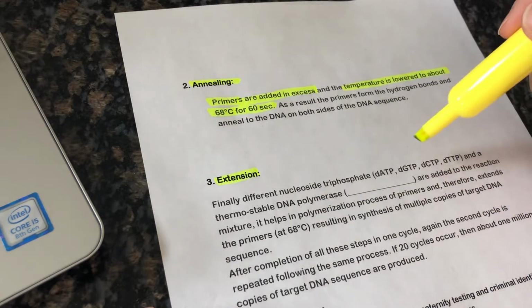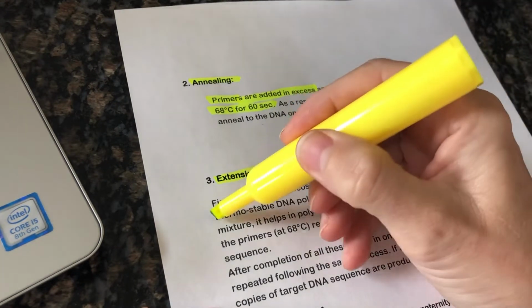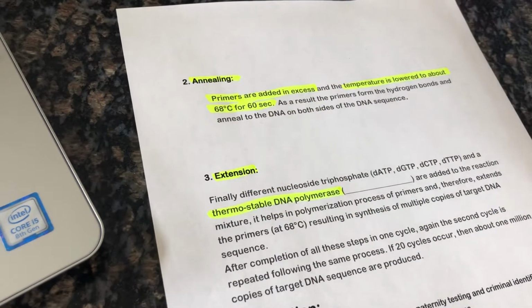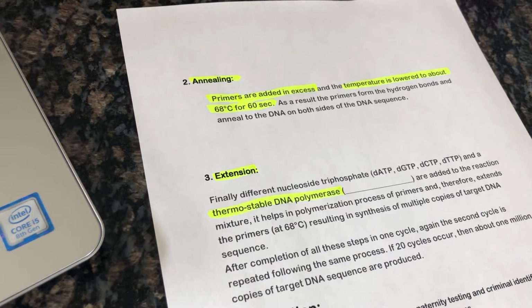So nucleoside triphosphates are added, and a thermostable polymerase, DNA polymerase, is added. So I left that blank because I like to just make sure that you guys are aware what that thermostable polymerase is and why it's of such importance. So think about this. Your body temperature is nowhere near the temperature of this machine, okay? And most organisms aren't near the temperature of this machine.